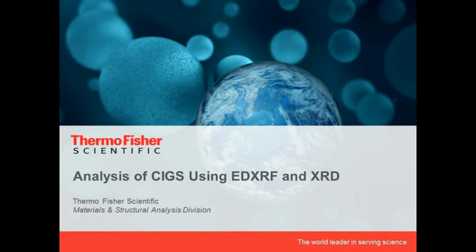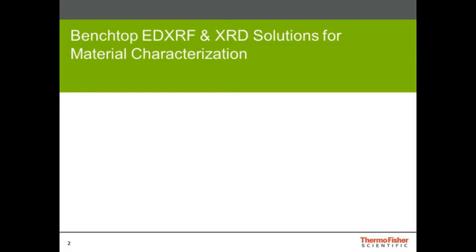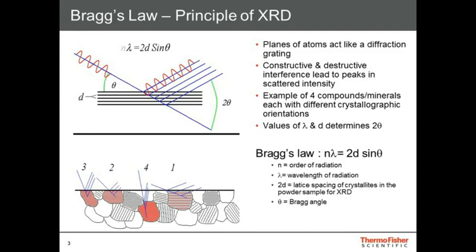In this presentation, we will mainly focus on our benchtop instruments, one X-ray diffractometer and one energy dispersive X-ray fluorescence spectrometer, and how they are used for materials characterization. First, I will give a brief introduction into the principle of X-ray diffraction, which might not be familiar to everyone.